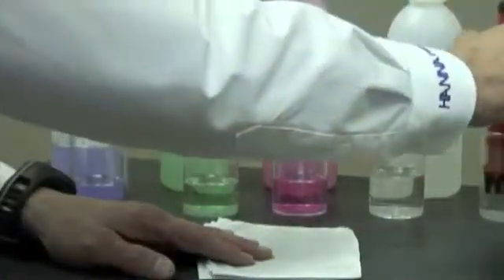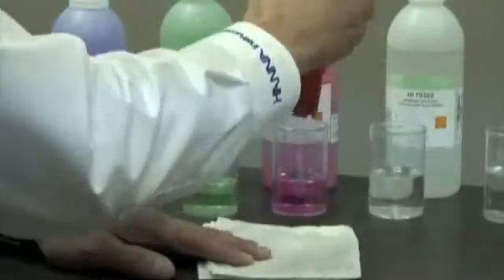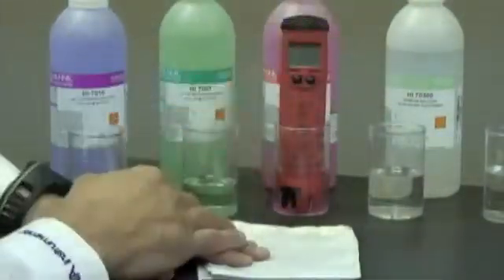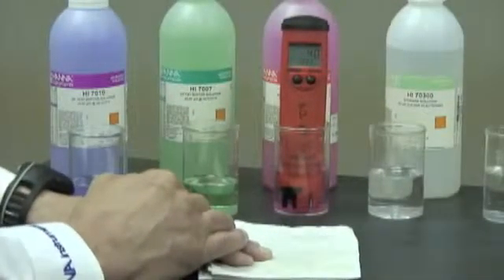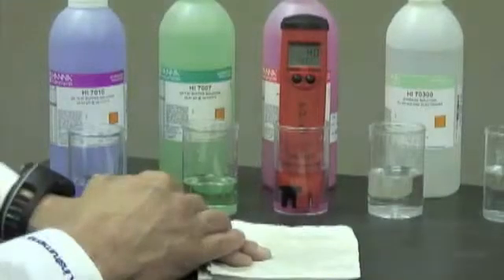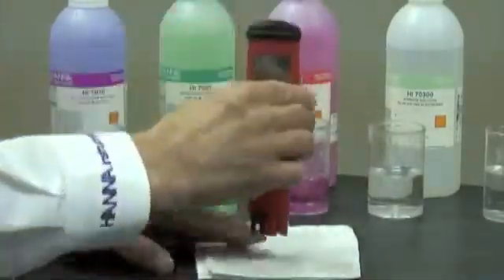So I'm going to rinse it off in water once again, get that buffer off. I'm going to put it into number 4 because that's what it's asking for. And now it's recording at number 4. Okay, we're ready to use our meter.